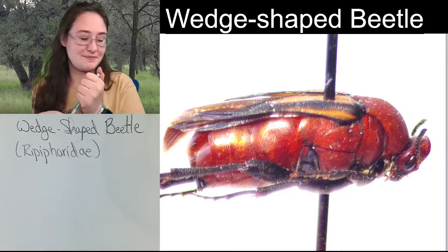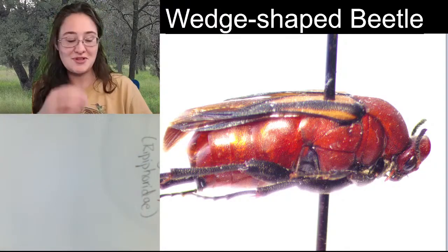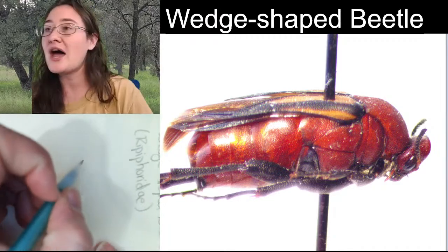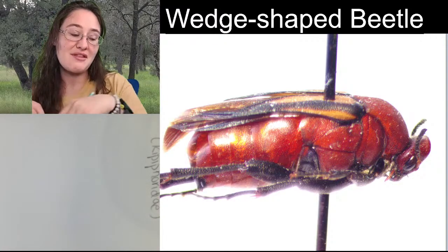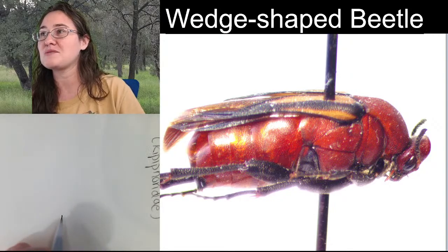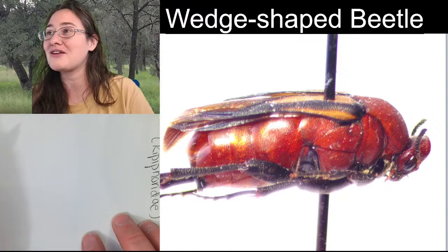Very good. And I actually might turn my paper landscape so that I can fit my beetle in a larger space. So up here in the front, when we're sketching, we always make sure that we're giving a really light outline in the base, and then I come back over and I darken some of the things. As we're sketching the full body, luckily we can see the entire specimen over the microscope.